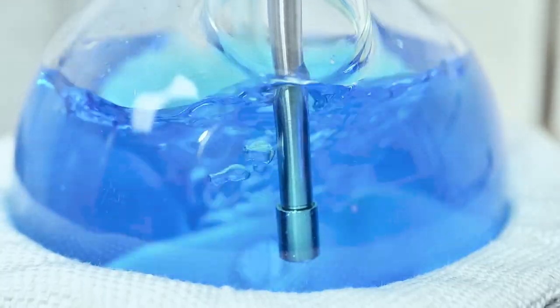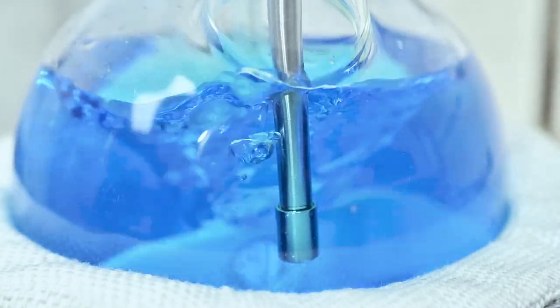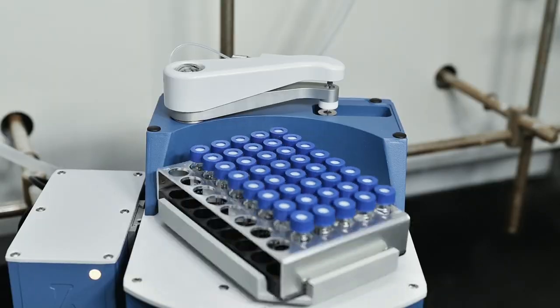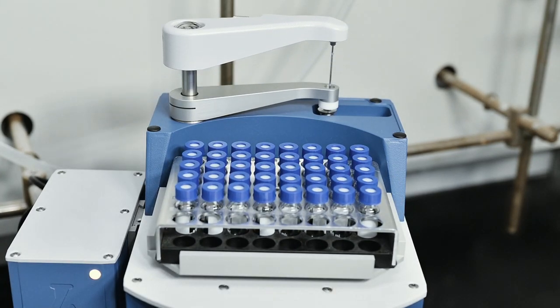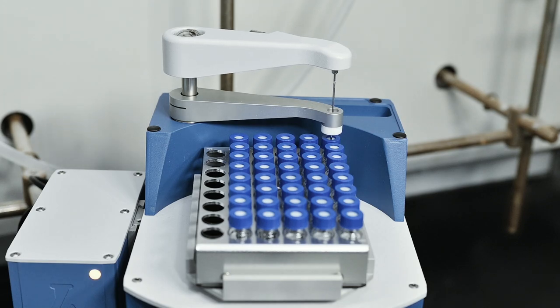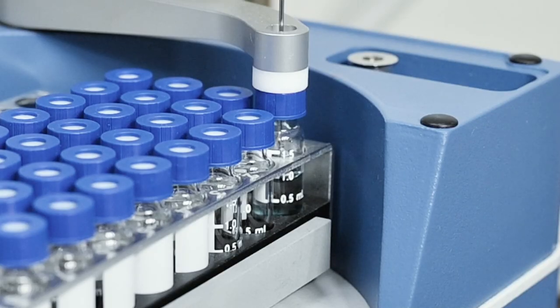The probe, while in the reactor, provides direct sampling of a customizable amount of liquid, which is then transferred to the vial by an inert solvent. The amount of solvent is controllable as a quench volume and defines the dilution factor of the sample.